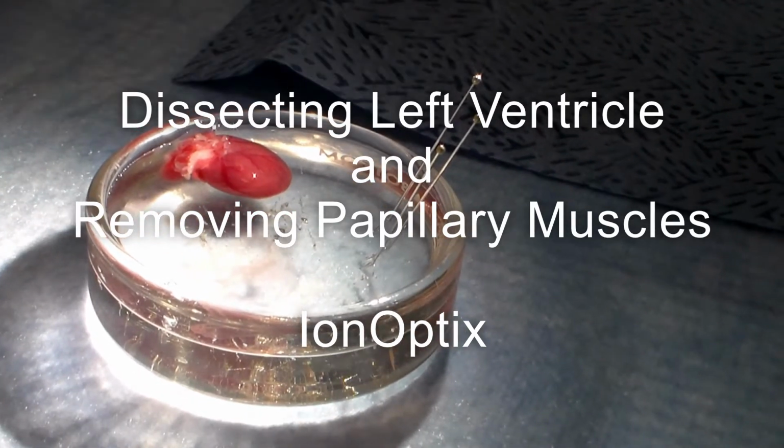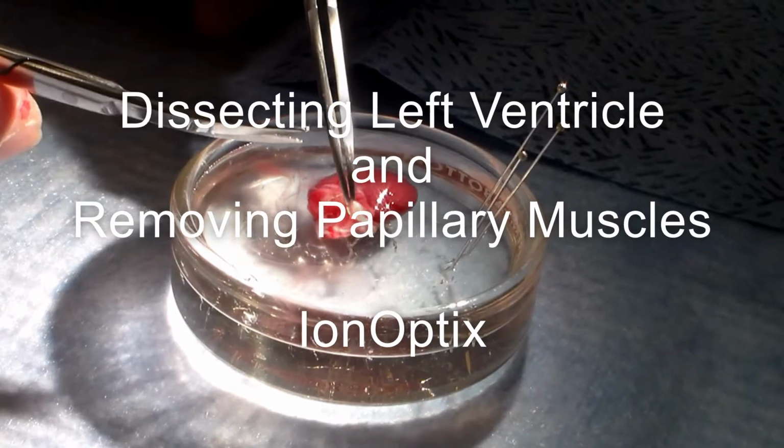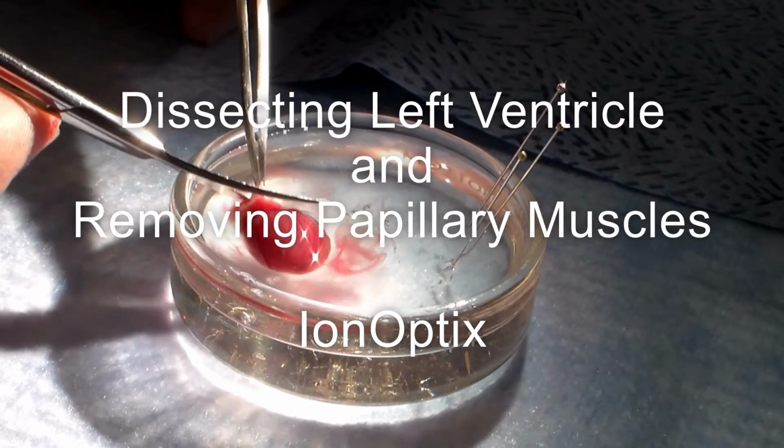In this video, we will demonstrate how to dissect the left ventricle and remove the papillary muscles.